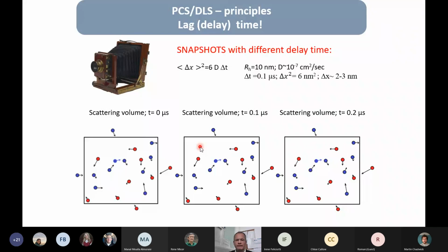So here, the blue color stands for the molecules, the proteins that are leaving from us. They go far from us, and the red ones are approaching us. As you can see here, there are no solid walls. Some particles can come in, and some particles can go out.